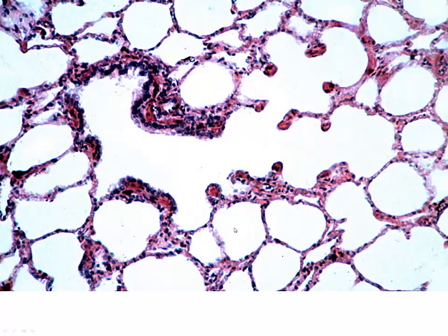Now, we recognize our bronchioles because they have the spiraling smooth muscle, the respiratory mucosa, but they lack the cartilaginous plates. Now, we mostly just refer to them as bronchioles because primary, secondary, tertiary, and that hierarchy, we really don't know. We just know they are intrapulmonary. You won't find a bronchiole outside the lung, so even intrapulmonary is a little bit redundant.